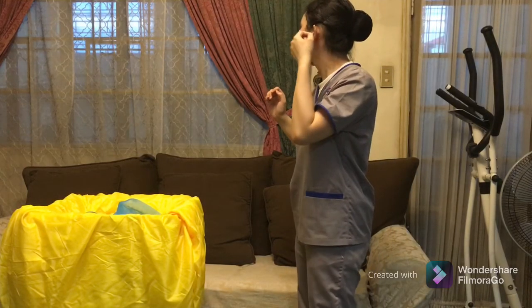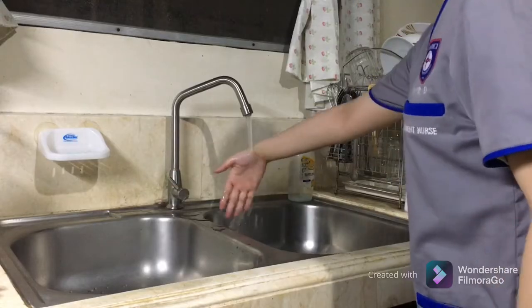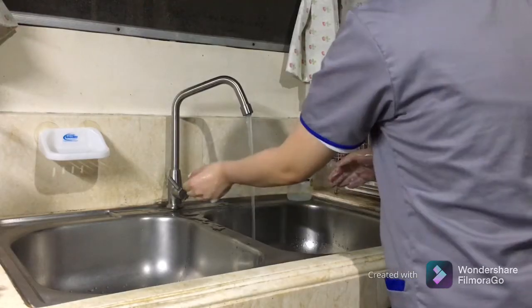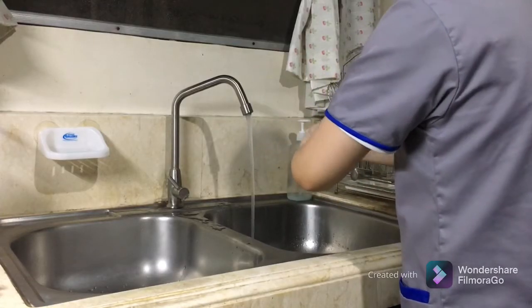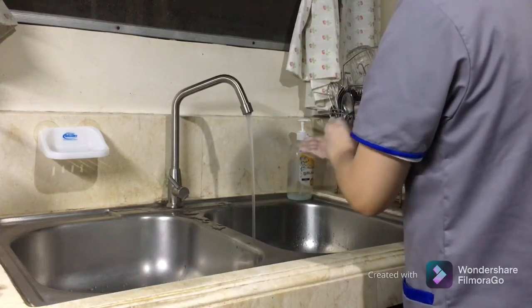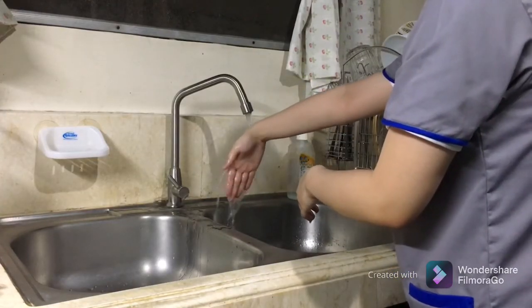Doffing of the face mask. Make sure to hold the strings and avoid touching the front surface of the mask. Discard the used face mask into proper receptacle. Perform medical hand washing. Thank you.